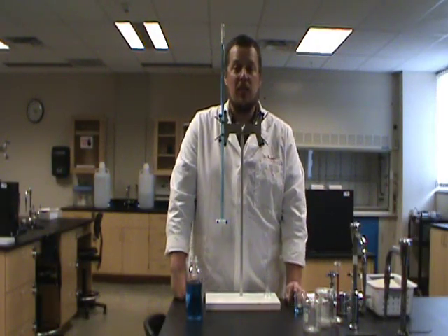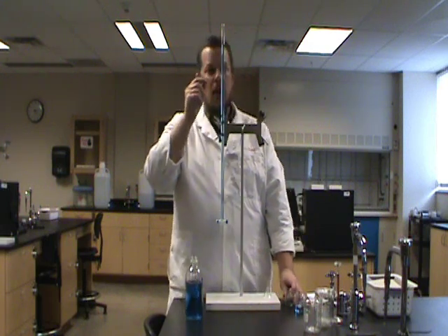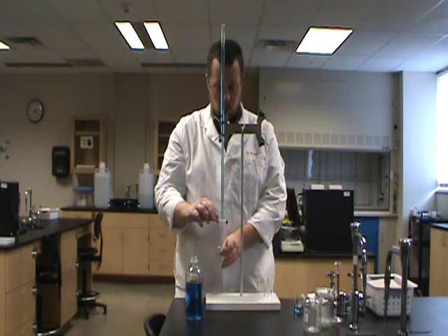Maybe our experiment wants 10 milliliters of liquid. It's an experiment that doesn't need exactly 10.00 milliliters, it just needs about 10 milliliters, but we want to know exactly how much that is. So I know that I'm starting a little below zero and I want to go to a little below 10 — let's start draining.